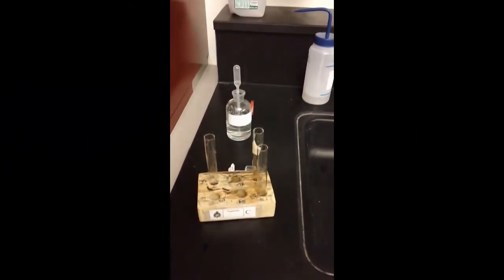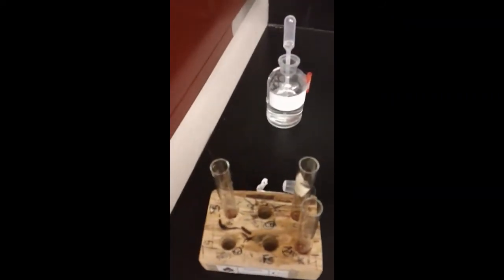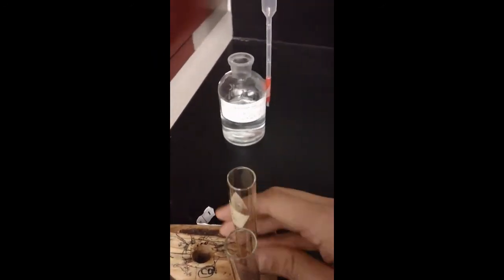Alright, so now I'm back on unknowns. I'm on test B, so I put test A aside, and now I'm only going to be working with our test B test tube. Okay, so I'm here running my tests for test B, starting with adding 5 drops of HCl to the solution. So I'm adding my 5 drops. Okay. I gently mix it. Okay. Next step of this one is to go to NH4Cl, and we're going to add 10 drops.